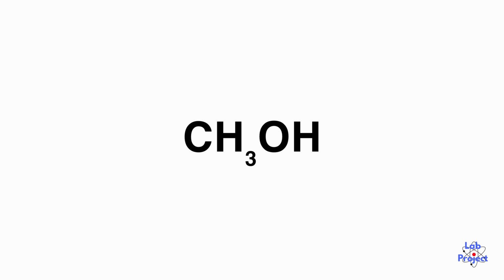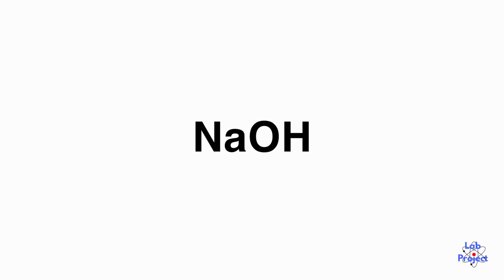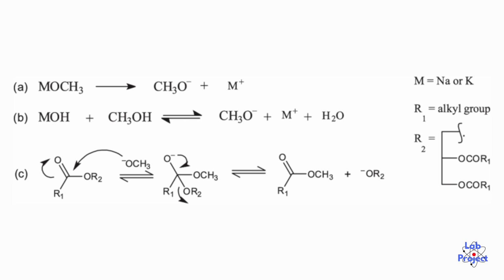In this case, the alcohol used is methanol, and the catalyst is sodium hydroxide. The role of sodium hydroxide is not to react directly with the oil, but to activate the methanol. In solution, sodium hydroxide deprotonates methanol, forming the methoxide ion, which is a much more reactive nucleophile than neutral methanol.